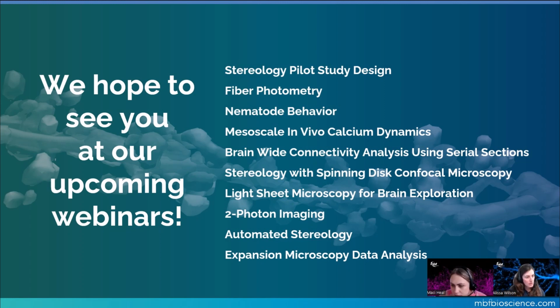Is it possible to do atlas registration 2D and 3D in Neurolucida 360? Right now, all of that technology we have for registration of 2D or 3D images, whether they're serial section or from a light sheet, all that lives in our NeuroInfo software. And I highly recommend giving that a try if you're doing that type of investigation.